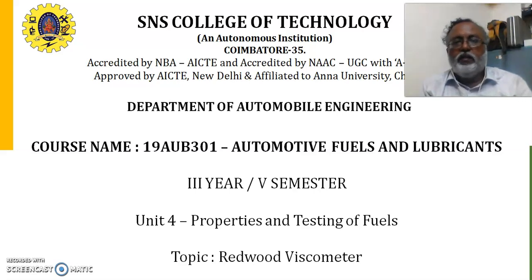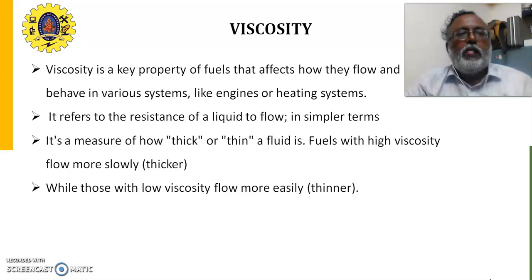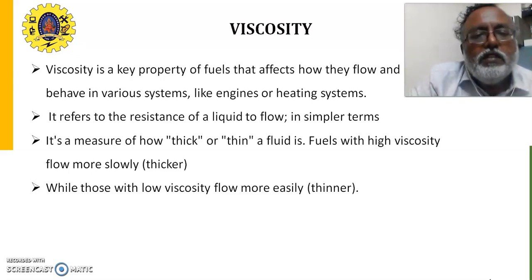Dear boys, here we are going to discuss the testing of viscosity using the Redwood Viscometer. So we know that viscosity is a key property of fuels that affects how they flow and behave in various systems like engines or heating systems.